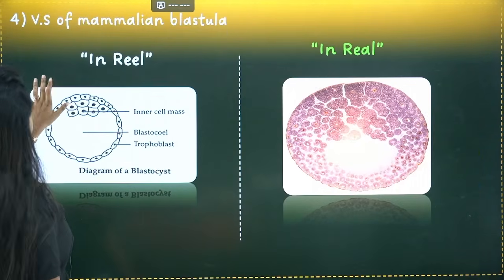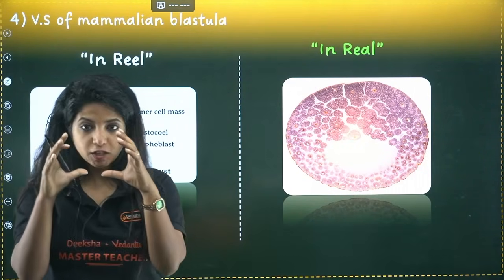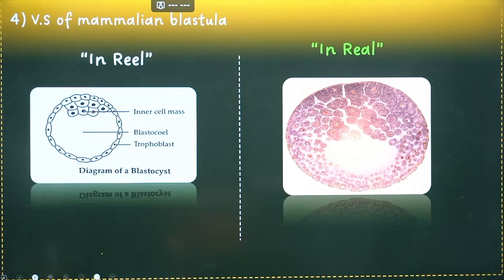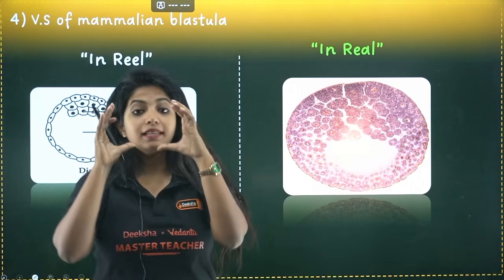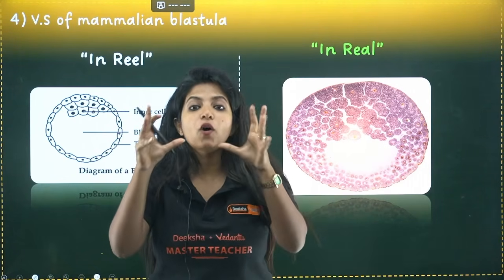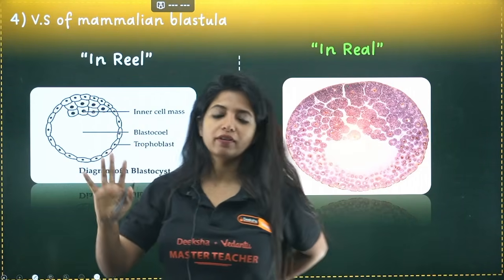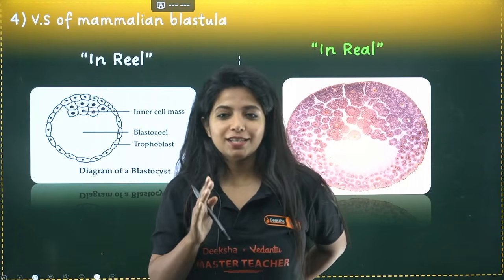Okay, fine. So over here, a zygote is being formed, right? A zygote has been formed. This is a single cell structure. Zygote divides to form an embryo. Whenever a single cell structure divides to form multiple cells, whether it be 2, 3, 4, 5, you will now call this an embryo. An embryo has multiple stages, and one stage is blastula.